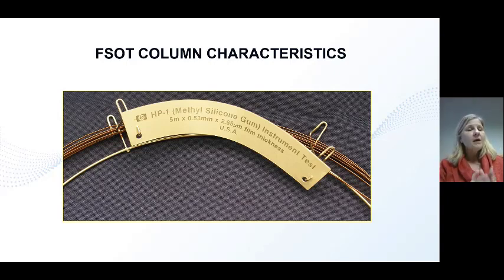So when I say after you have tried using a different program to separate your compounds and you still don't get an efficient separation, you can look at what column you used. If I need a longer length, if I don't need 5 meters but 10 or 30 meters, then you can just go and buy a column that has a longer length, or change your stationary phase completely.